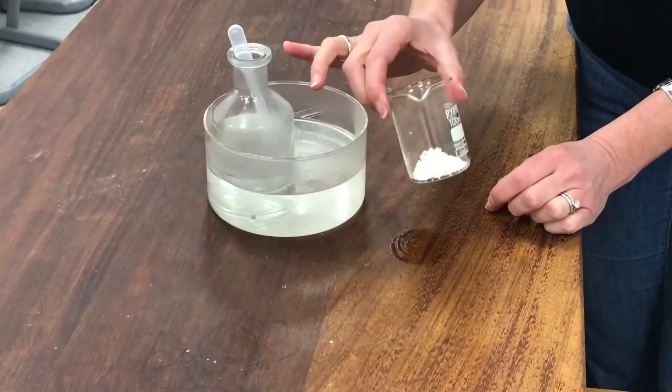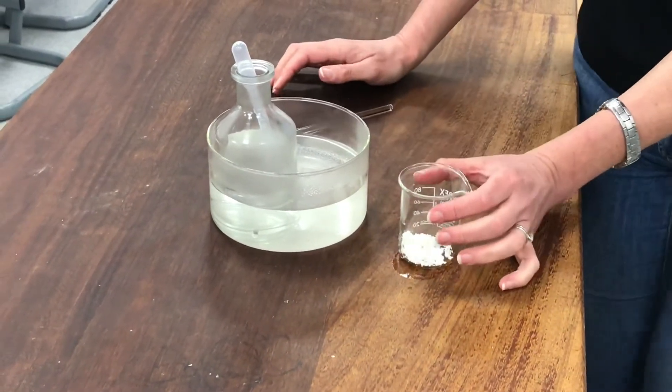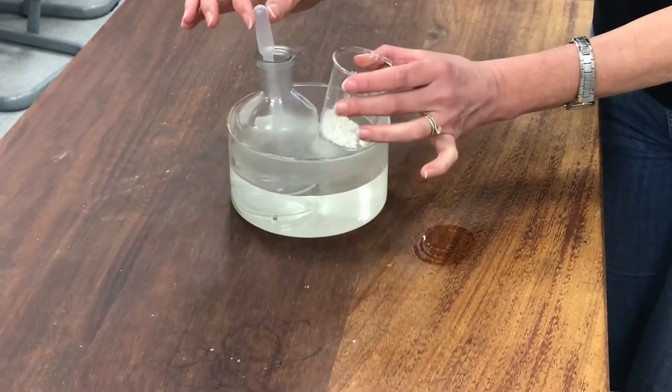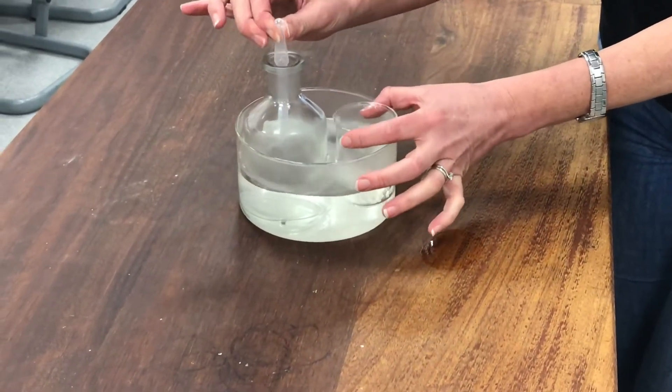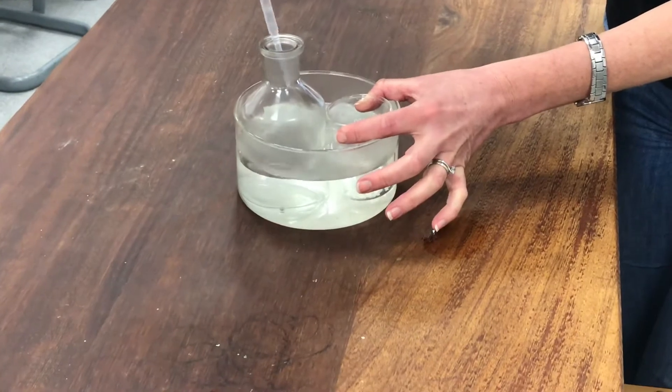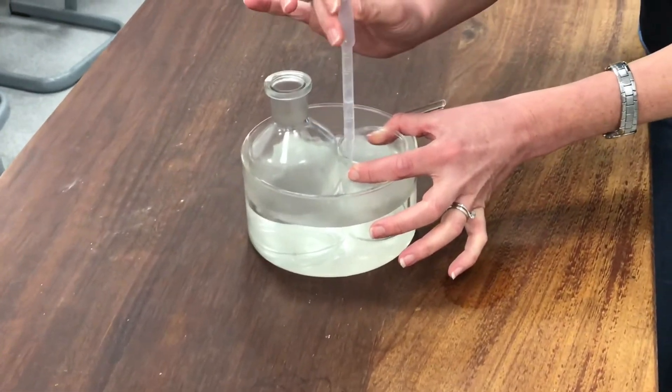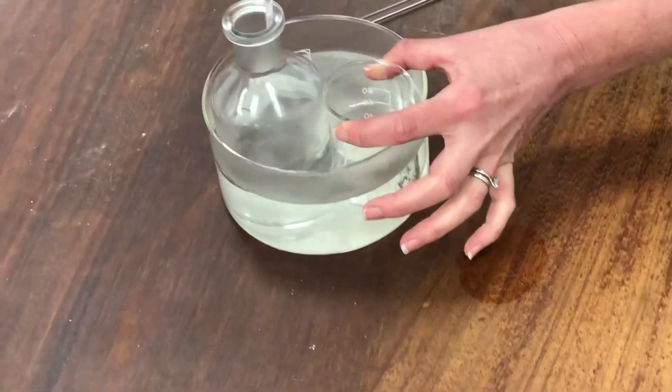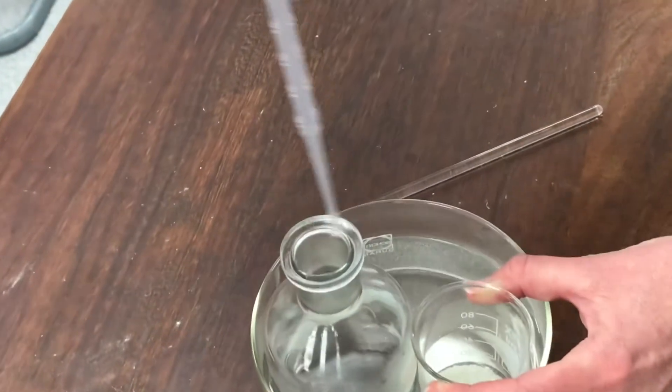So this is my product that I've extracted from the Buchner funnel. And I'm now going to transfer it to this water bath where I've got some nice warm ethanol, some hot ethanol. And I'm going to try to recrystallize it from the minimum amount of hot ethanol. I'm going to add some ethanol to the mixture and try to get it to dissolve.